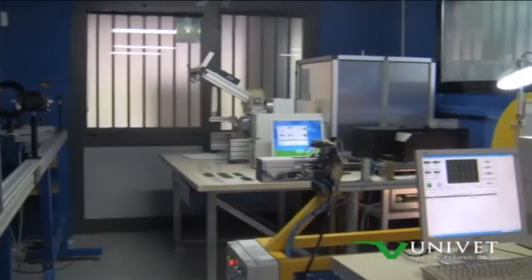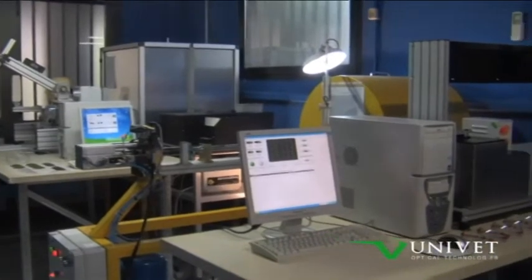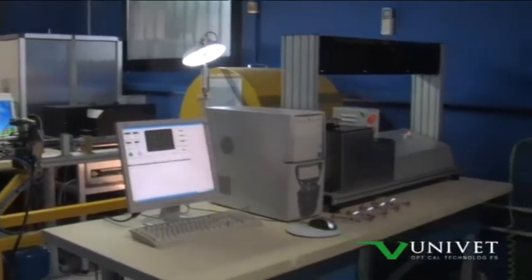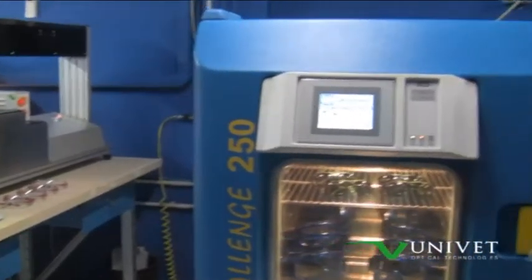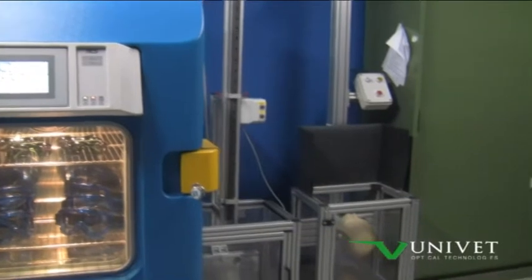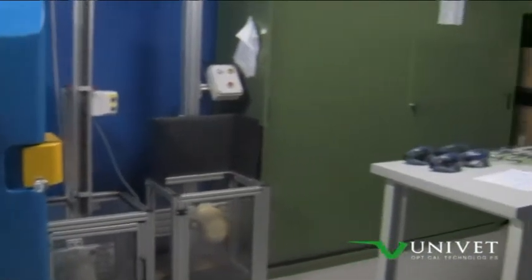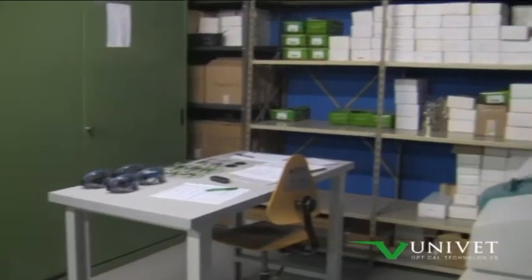The laboratory tests is the flagship of Univet Research and Development Department. This facility is equipped with the most advanced instruments and equipment to perform the tests required by the international standards EN166 and ANSI. The laboratory is used to support the development of new products, to verify the certification requirements, and for quality control acceptance.